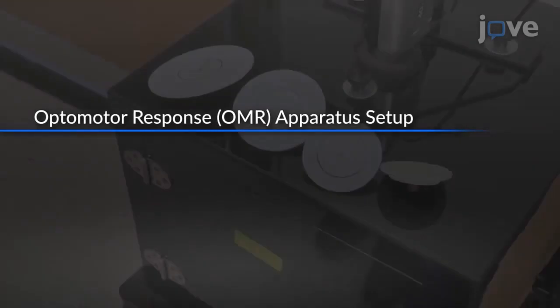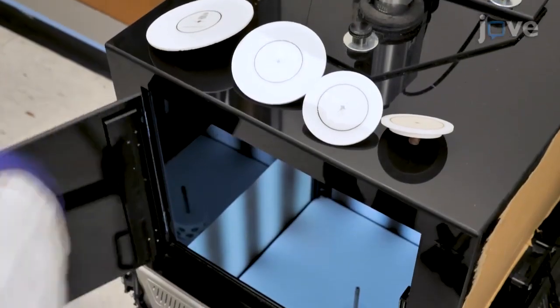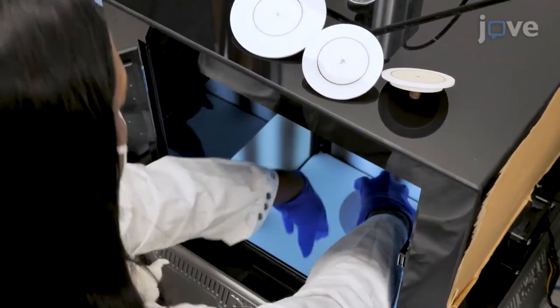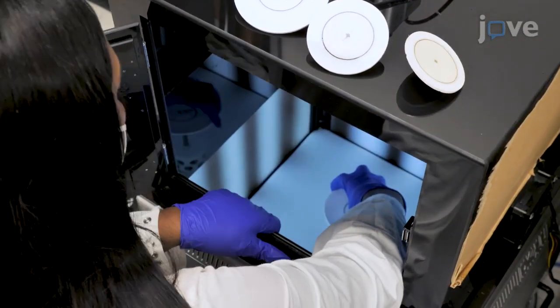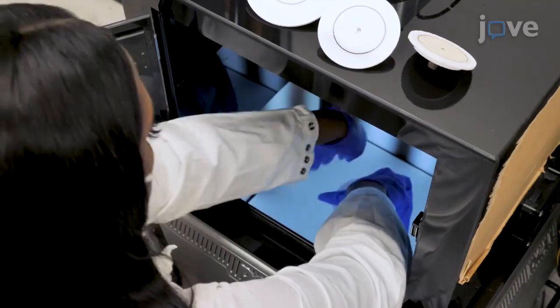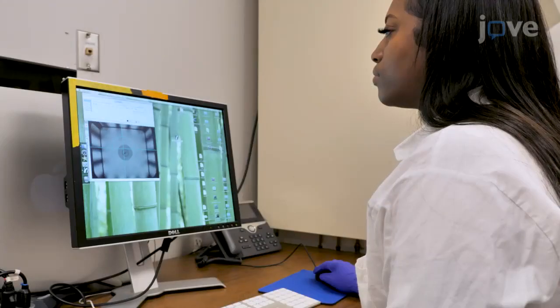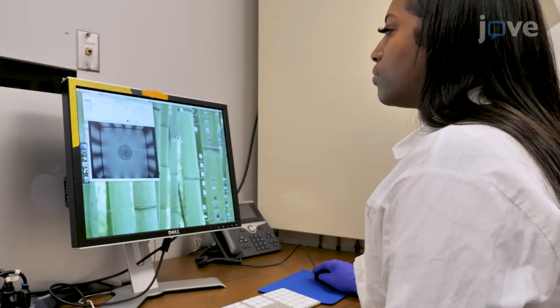To set up the OMR apparatus, first select an appropriate sized platform for the experimental animal species to be used, and open the OMR software.